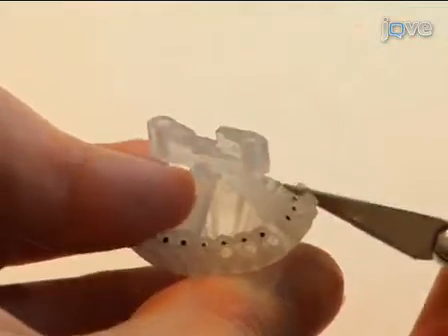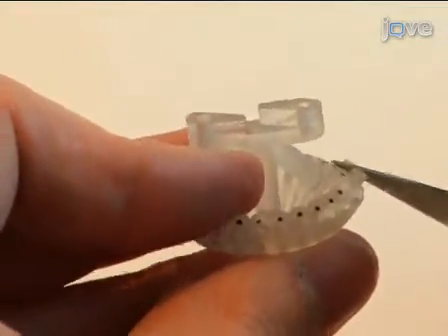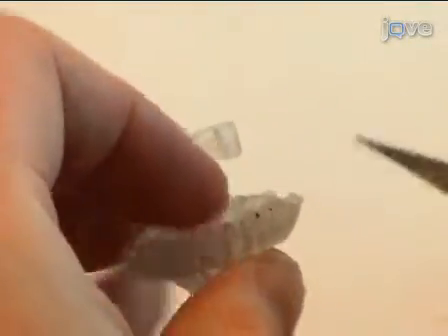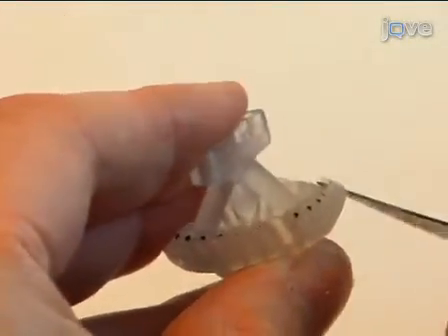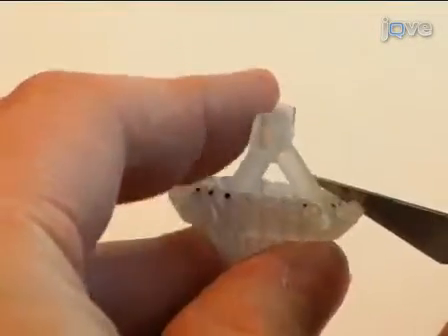The plastic base design features a tap starter for each screw pilot hole to make sure the initial threads are not damaged during the threading process. After all pilot holes are threaded, these tap starters can be easily snapped off using a razor blade.